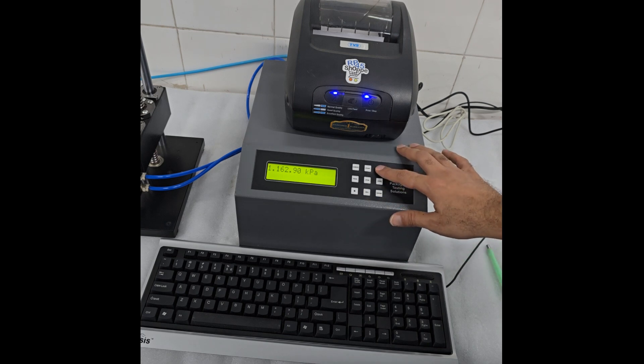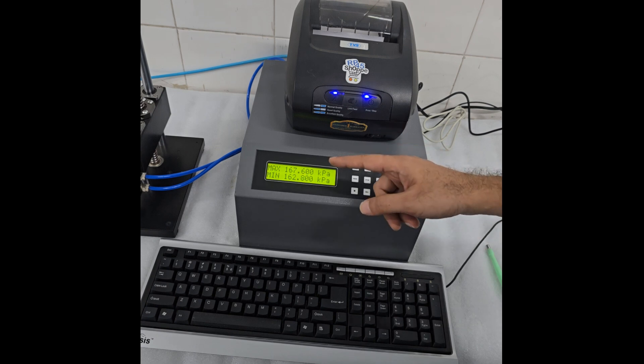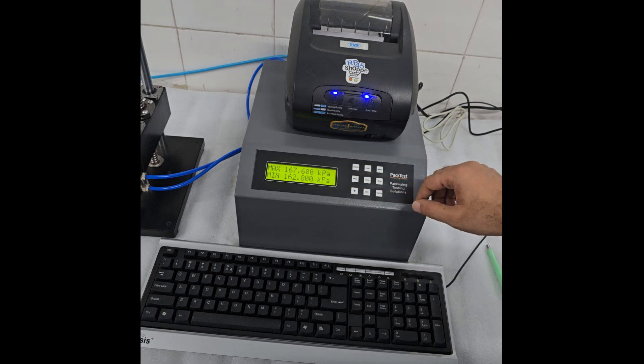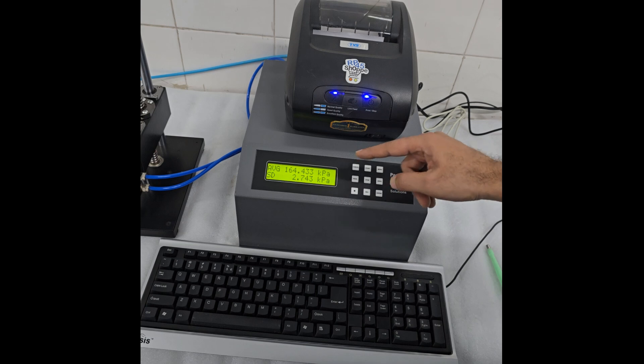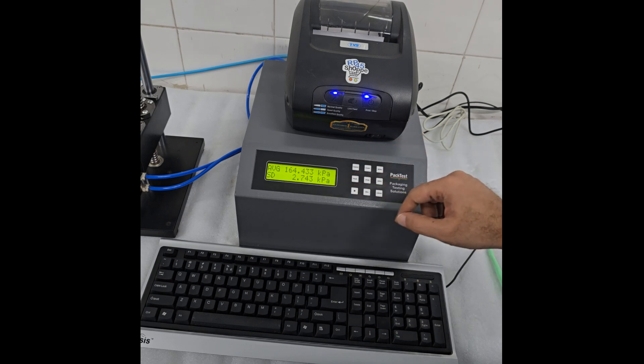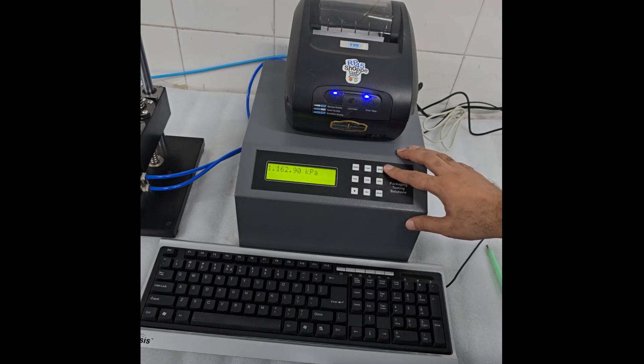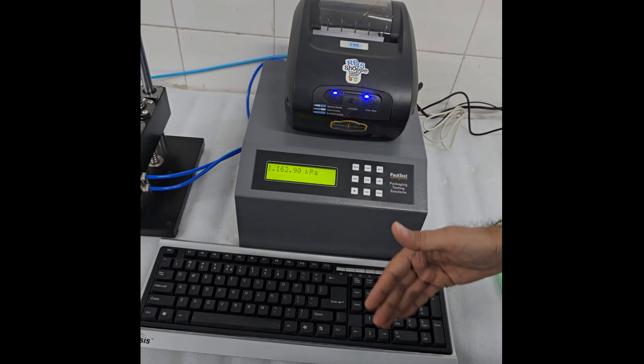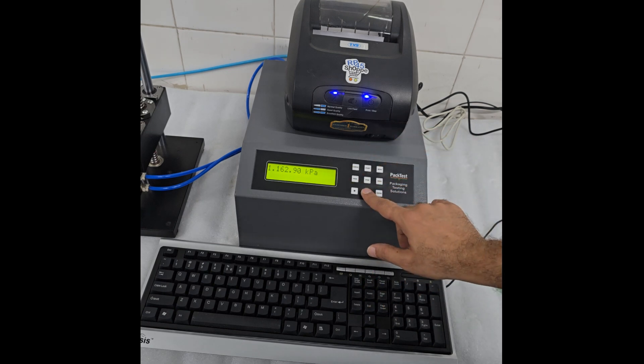Press Menu Key. You will see minimum and maximum readings. Press Menu Key again, you will see average and standard deviation. Press Menu Key again, you will be back to the individual readings. Go through the readings again if needed.